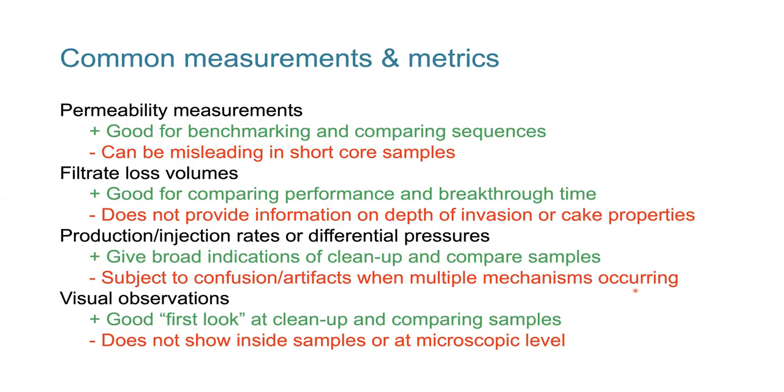So ideally you have a nice long core sample, as long as you can fit in your core holder, or let's say where we can get deeper than the depth of invasion of solids and fluid. But that's going to be multiple feet, which we have to be realistic about isn't possible. We have to take these compromises.